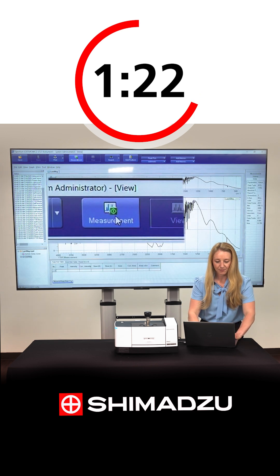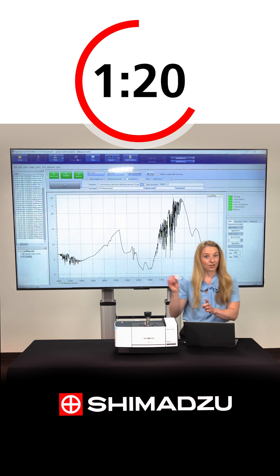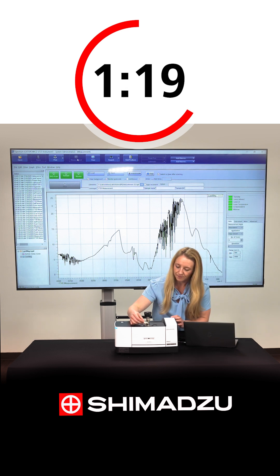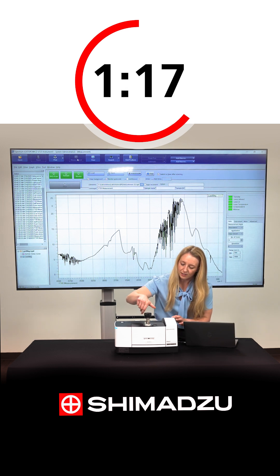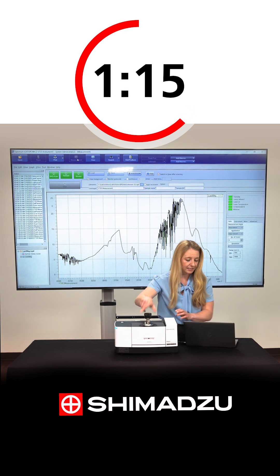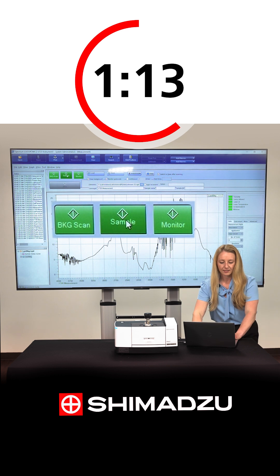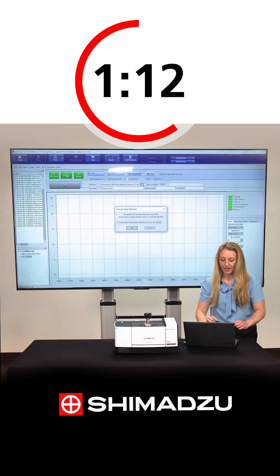Go back to measurement mode and we can load our sample. Screw down the ATR until it clicks, and select sample scan.